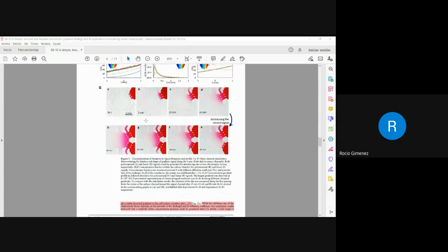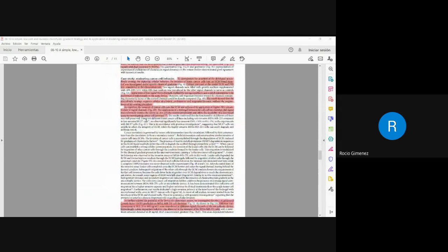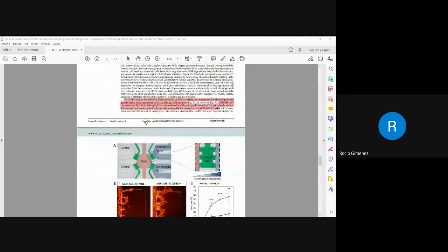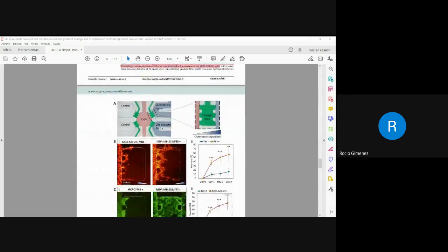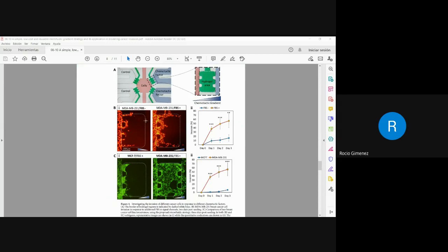To demonstrate the potential of the development of a strategy for capturing cellular behavior, the invasion of breast cancer cells into an extracellular matrix-based material was investigated. They used Cultrex as a model for extracellular matrix and fetal bovine serum as the chemoattractant. The application of four signal microchannels enabled the testing conditions and control experiments to be performed simultaneously in the same device.